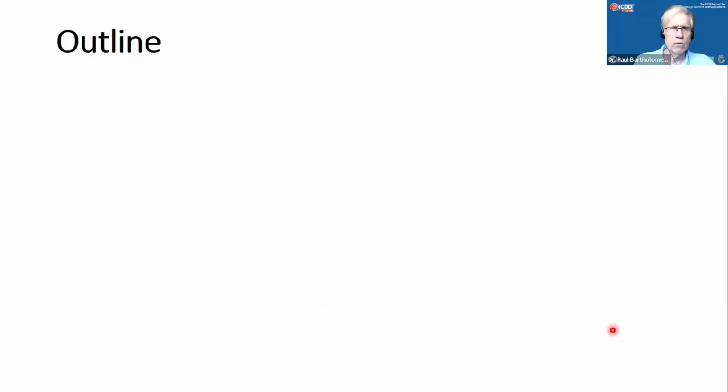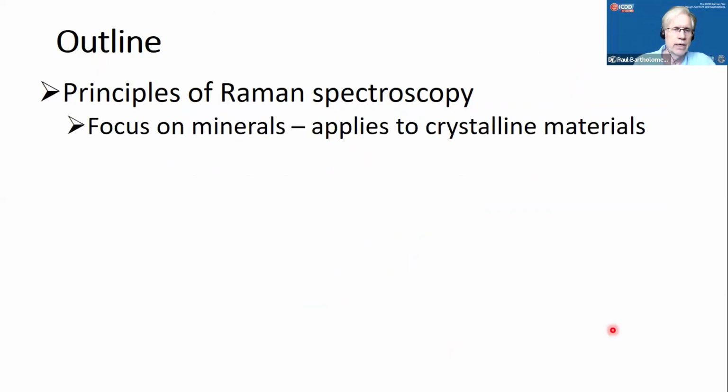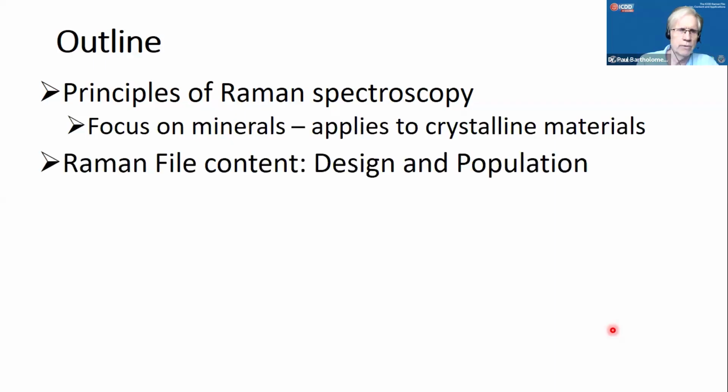Quick outline of what we're going to be talking about today. I'm going to start with the principles of Raman spectroscopy. At this point, it's still not a universally known technology, so we're going to quickly go through that. And yes, I'm a mineralogist. The initial release of the Raman file is on minerals, but the principles apply to crystalline materials. Some of the principles apply to Raman of liquids and gases as well.